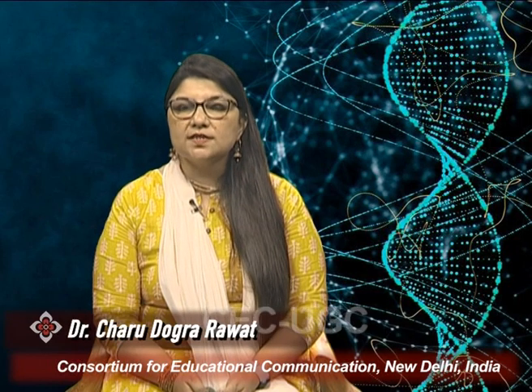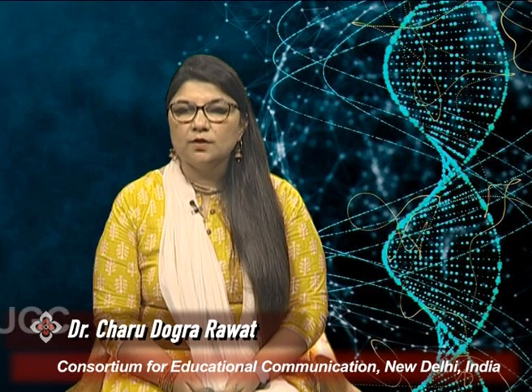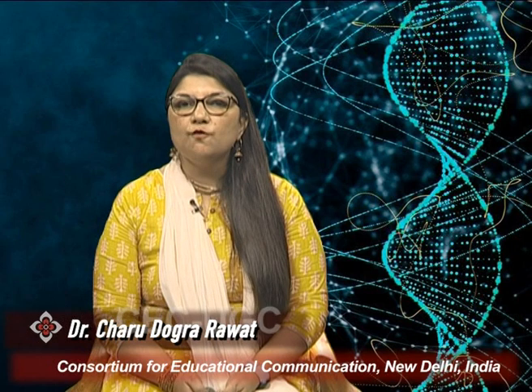The next generation sequencing methods that we are discussing have revolutionized the biotechnology sector. We have been discussing the Illumina sequencing method, and this is the workflow of NGS. The first thing is the isolation of the genomic DNA, the fragmentation of genomic DNA and tagging of the DNA with the adapter molecules. So, we continue from there.